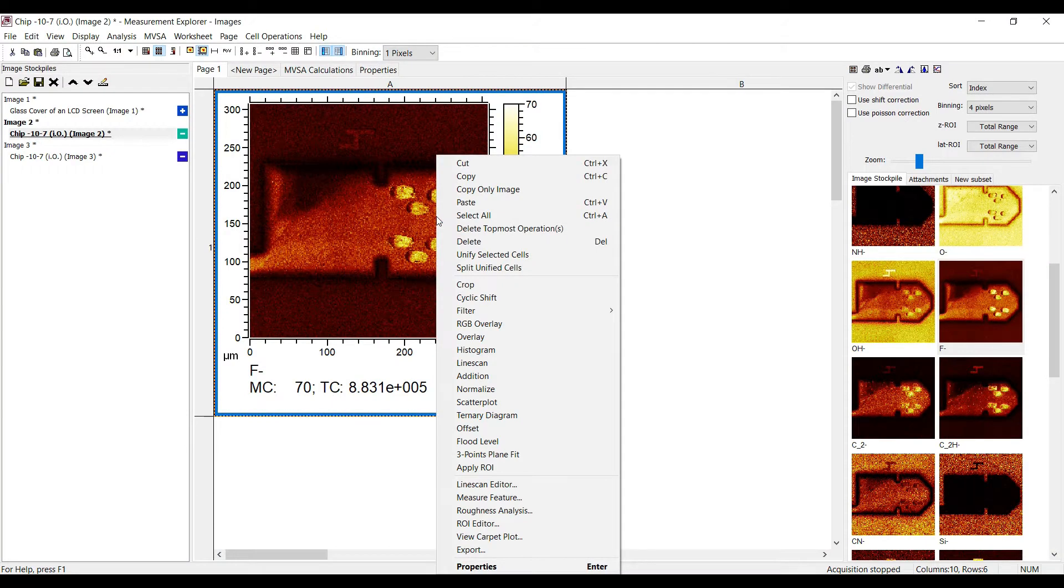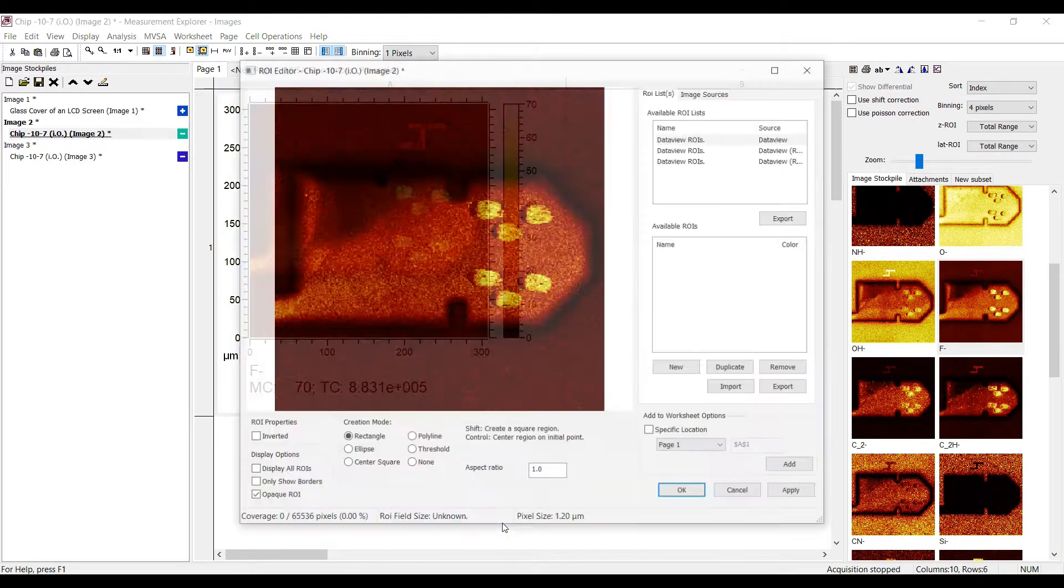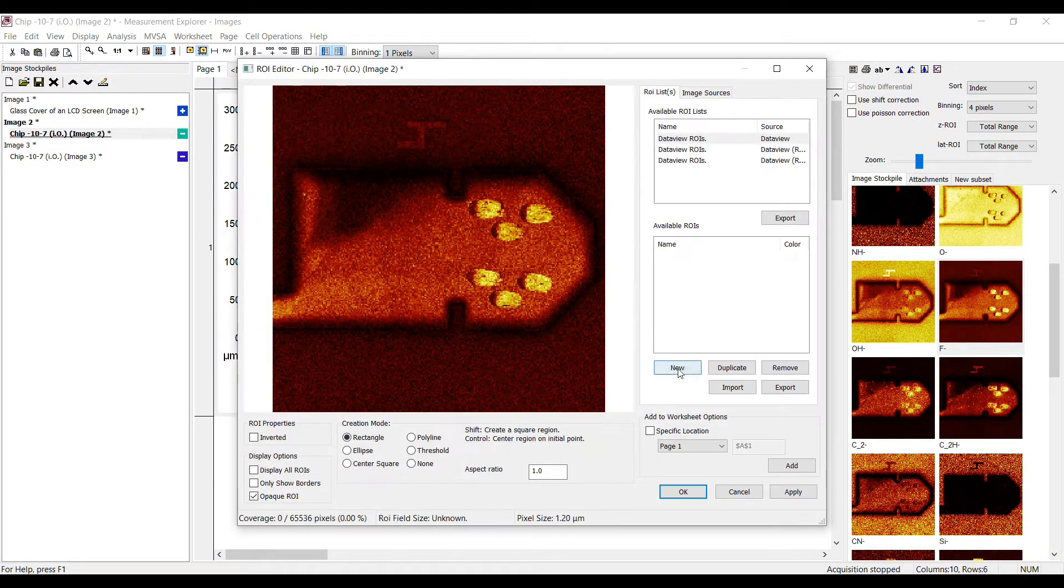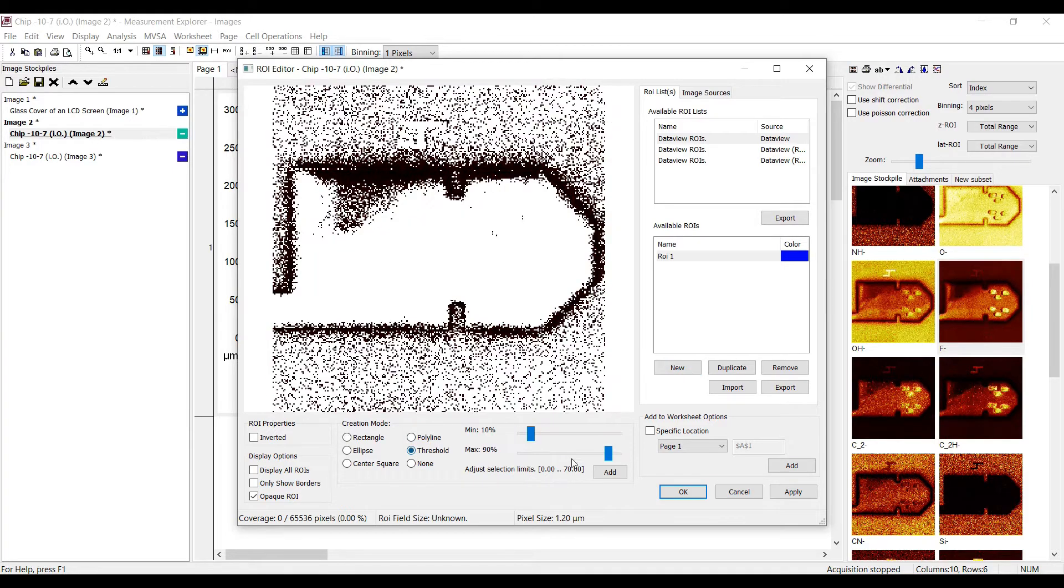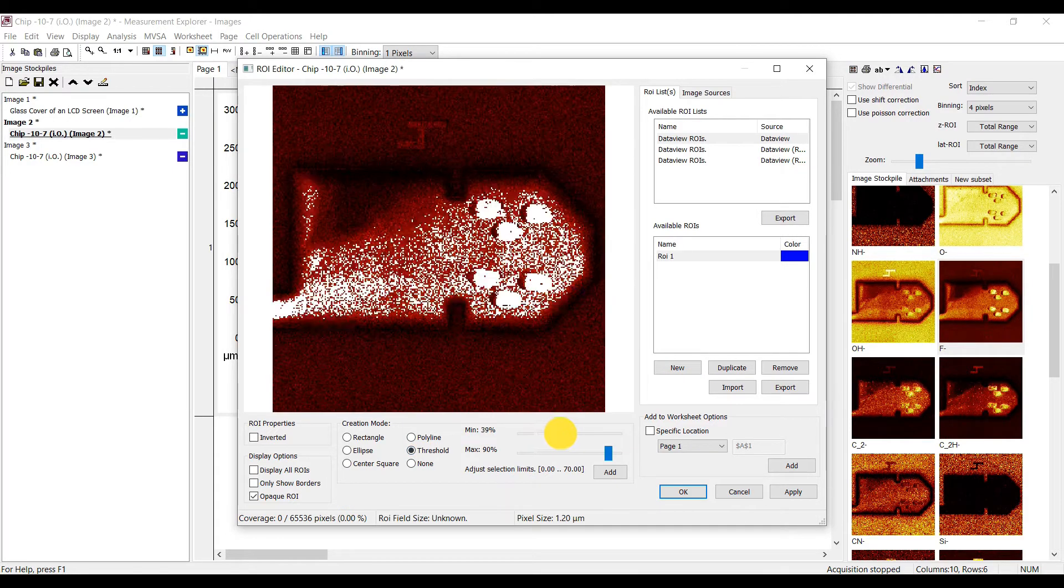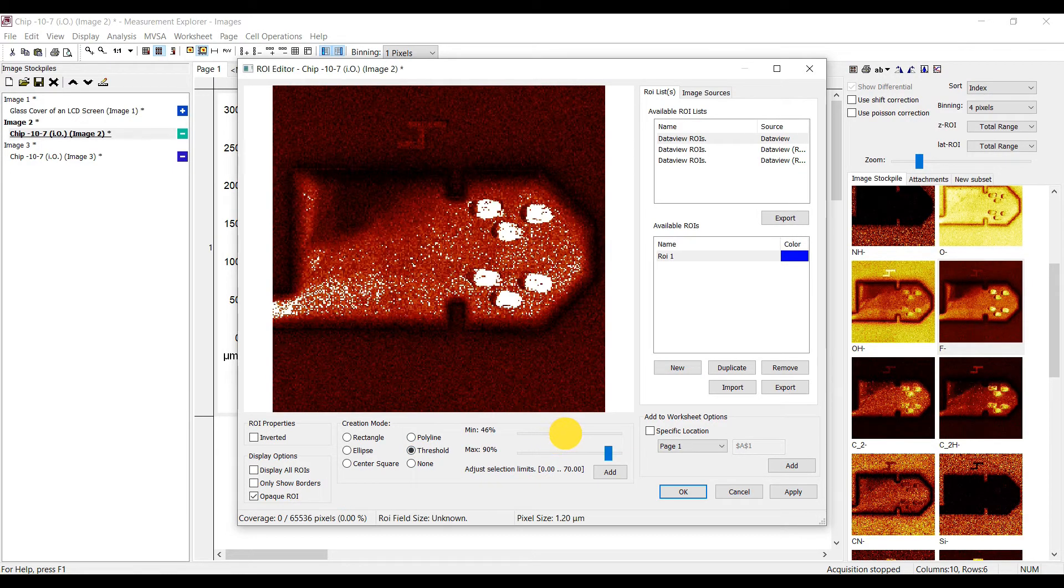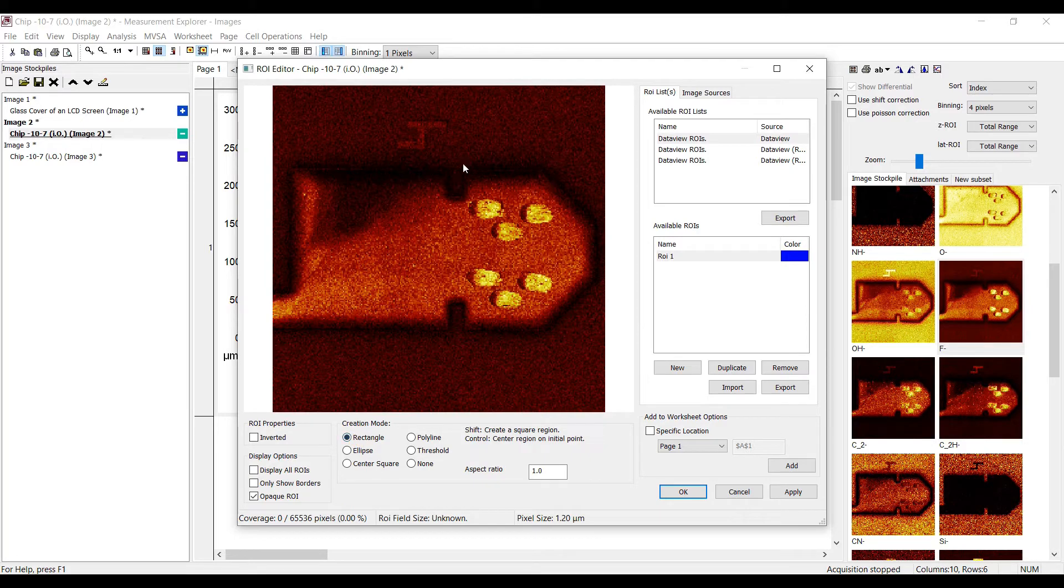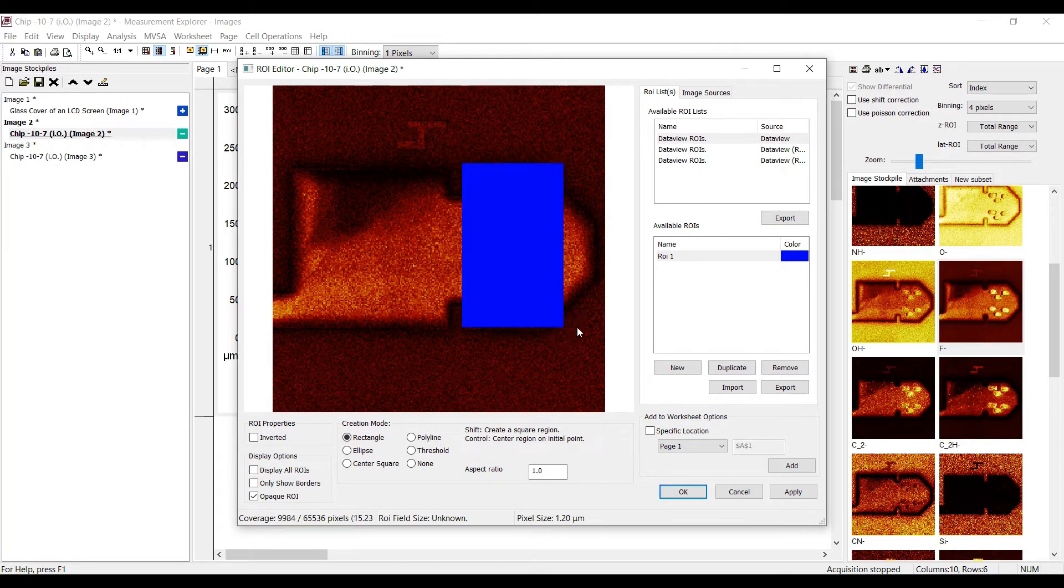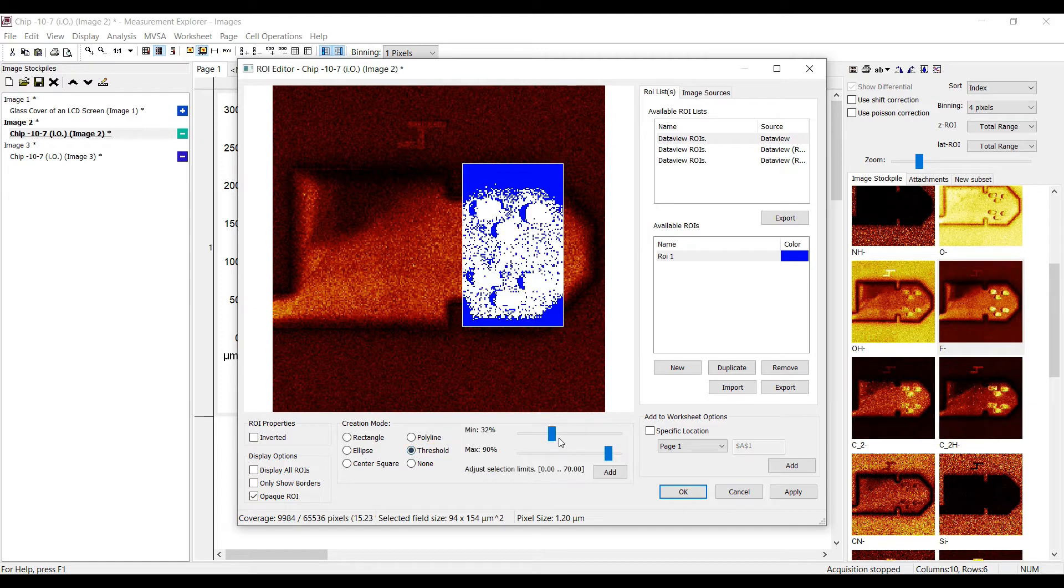Let's go on with the ROI editor. You already know that you can use the threshold tool to select your region of interest. But did you know that you can limit the region where the threshold is applied as well? For this, create a rectangular region first, select it, and choose the threshold mode after that.